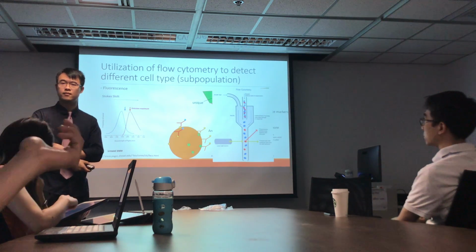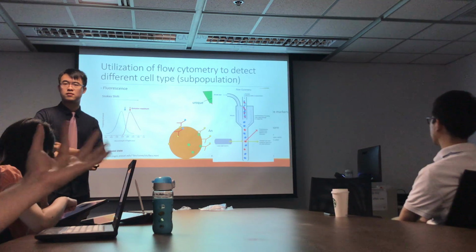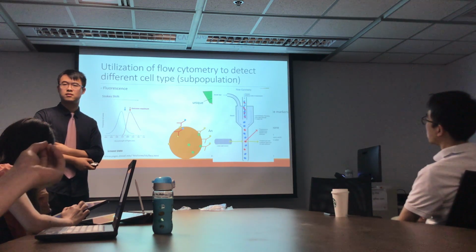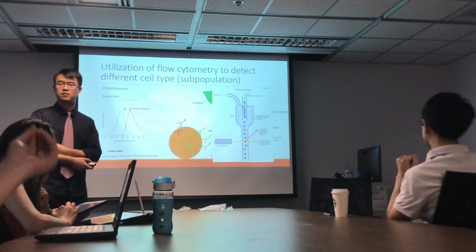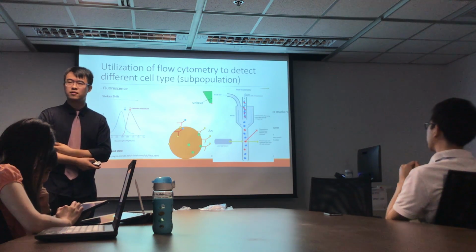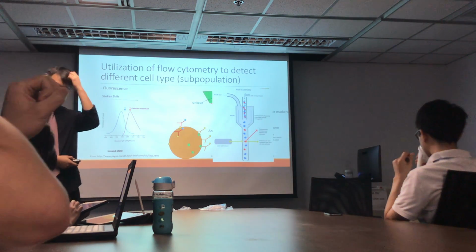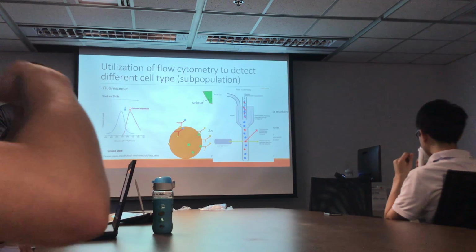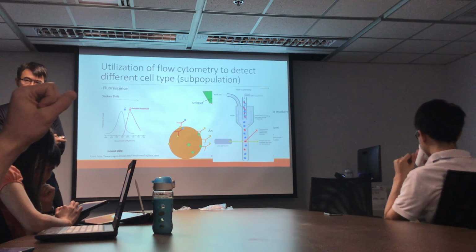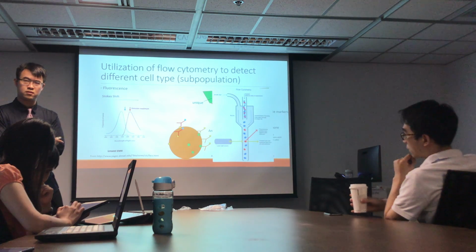Inside the cell there are different components. If the light source is in the cell, how do you know whether the light emitted is affected by, as you mentioned, scattering by the organelles? Is there any method to correct this before they sort the cell? Fluorescence, we're differentiating by color, so you don't care about the intensity.